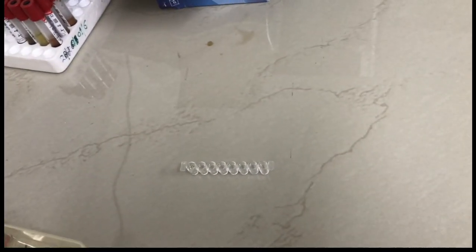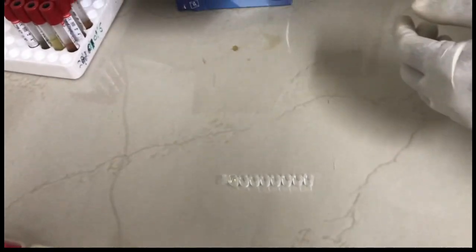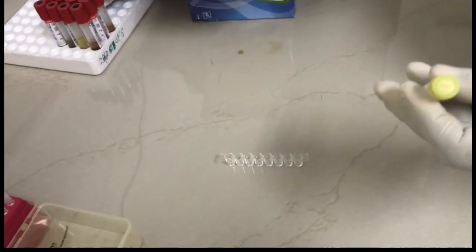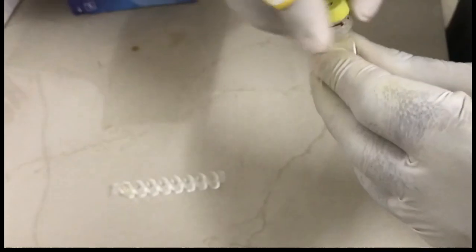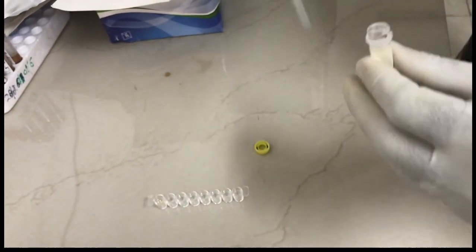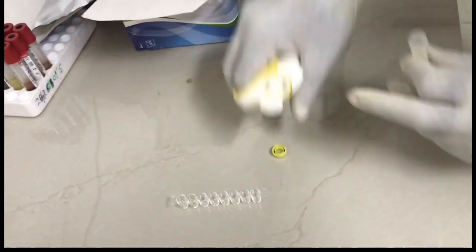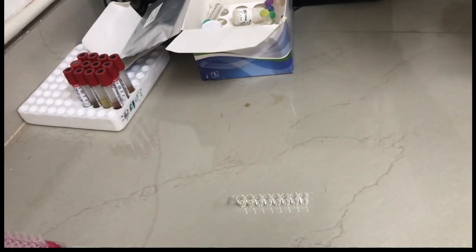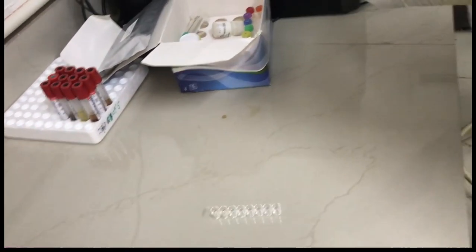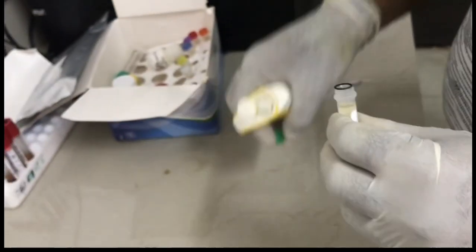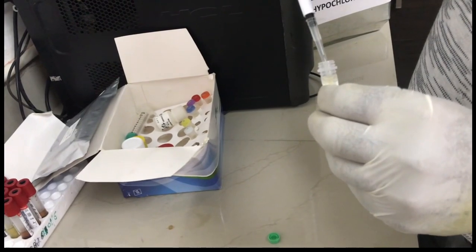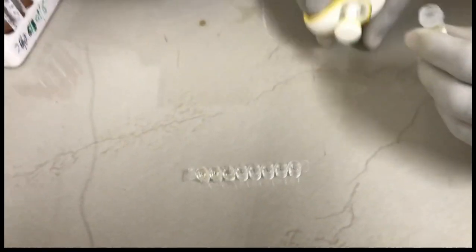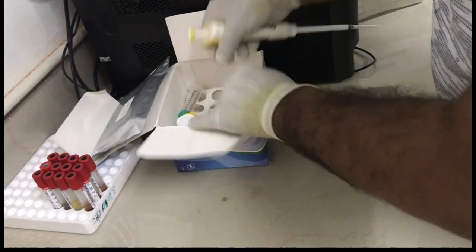Then we will discard the tip and take a new tip for it. Every time we have to discard the tip. Now here, this is control B, which we will take in the second well. We discard the tip every time, using a new tip each time. This is a potentially hazardous process, so we have to be very cautious while doing all these steps. This is control C, we are taking this control and putting it in the third well.